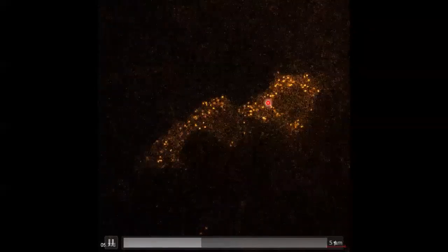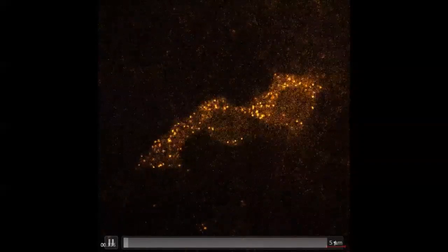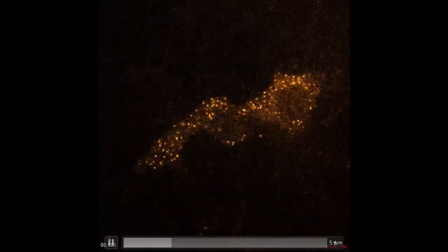You can see a bit of bleaching from the end to the beginning, but it is really limited, and you can still see your cells. And remember that you don't need a pretty picture to get a result. In this case, these people are interested in the movement of each of these particles, so we're going to track it over a very short period of time, and that's all that matters. It's the numbers. It's not really how good the resolution of the image is.